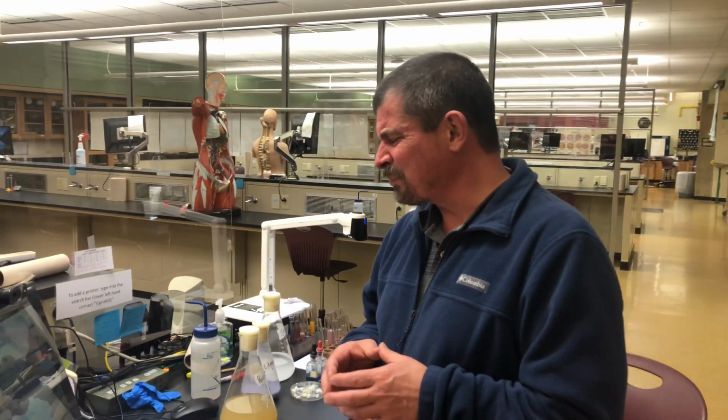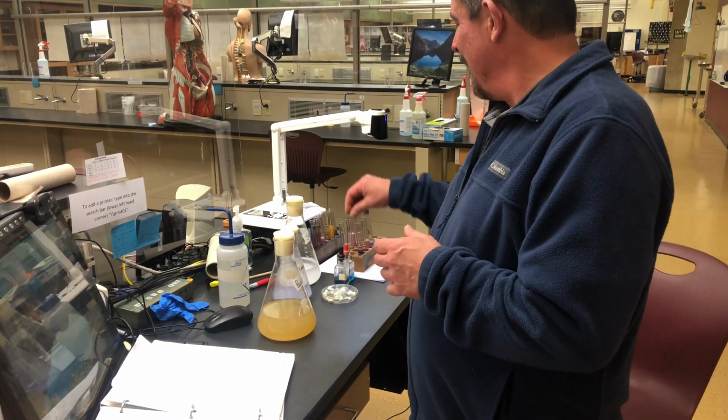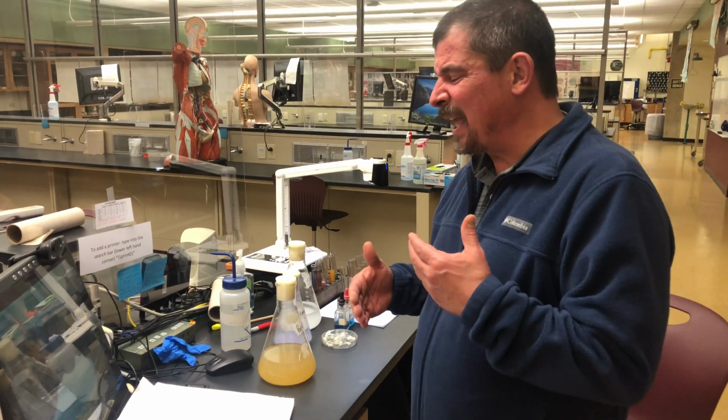What we're going to do is run 3 experiments that involve the digestion of protein, carbohydrates, and fats. So without any further ado, here we go. First, on page 46, we're going to show you the process of protein digestion. As we go down, we're going to have 2 test tubes, and in those test tubes, we're going to add an equal amount of protein, as your checklist said. The protein that we add is egg whites.